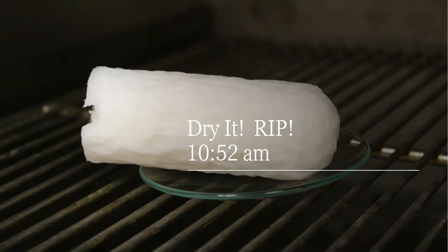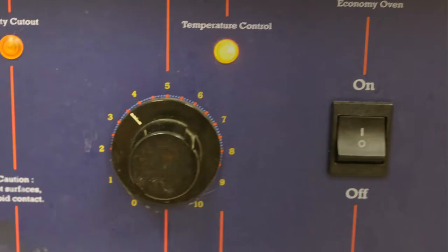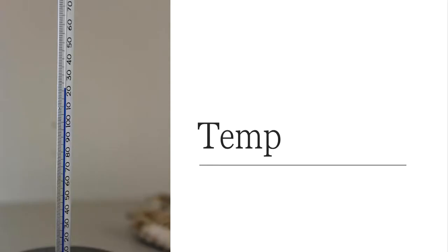Well, I don't want to throw that piece away because this was weight. It was mass that was assigned to my thimble in the very beginning. And if I do not include that later on, then I'm going to get a wrong number for the mass. And this could cause me a little bit of problem later on down the road. So I just want to keep all of these pieces that did shed off because of my silly decision that I did in the very beginning. All right, so I put that into the oven. Here's the oven setting. Again, you can write that down on your own. And then here's the temperature setting for that particular oven at that temperature.